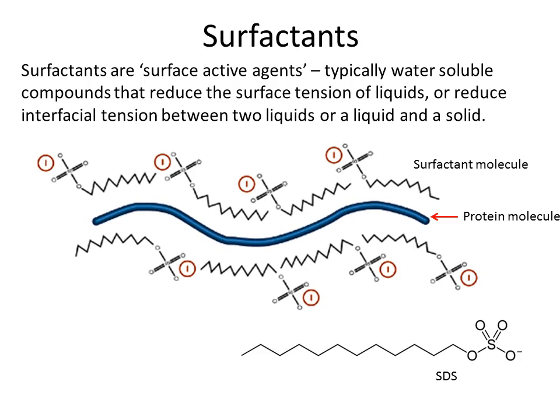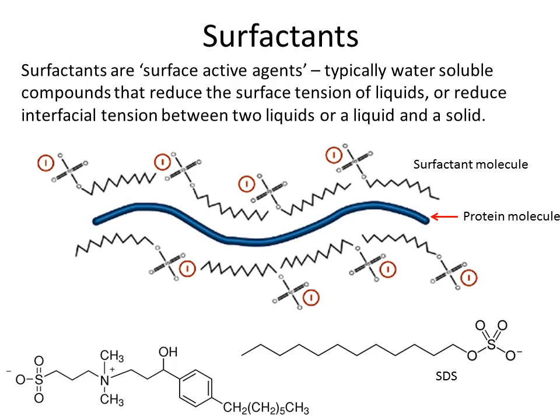The most widely used surfactant is sodium dodecyl sulfate, or SDS, which has a strongly anionic group and can solubilize most proteins, including membrane proteins. However, its strength is also its weakness, and its strongly anionic nature means that it cannot be used for separating proteins by charge, something we'll return to. To overcome this, a number of surfactants have been produced that are zwitterionic, having both an anionic and cationic site in the molecule that allows interaction with water molecules, but means that their overall charge is zero, and thus they won't move in an electric field like SDS.